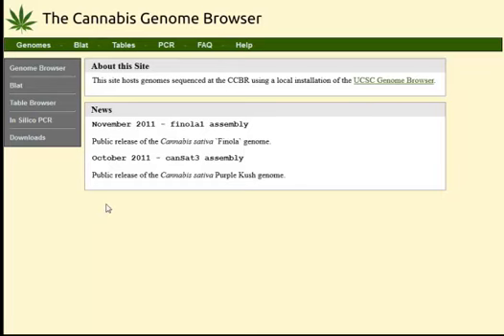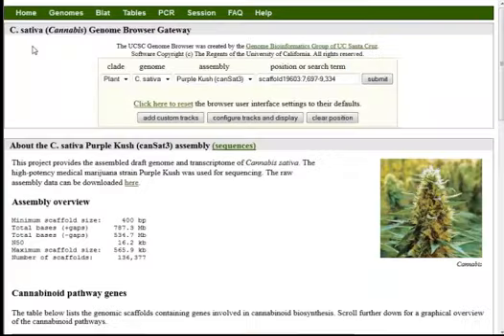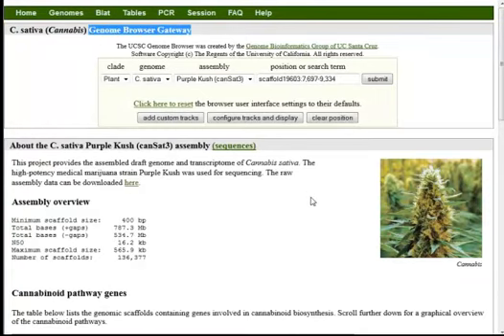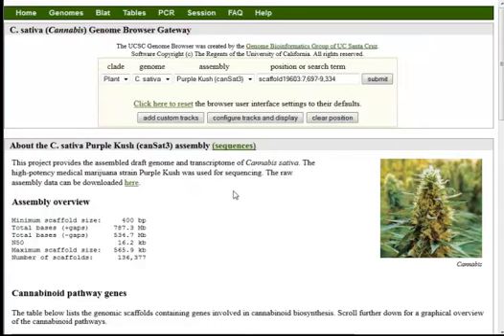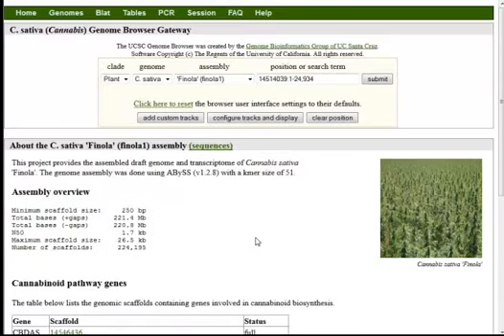Today I only have time to show you a couple of things. I'll quickly show you how to browse the genome. If you're here on the Cannabis Genome Browser and you click the link that says Genomes, you'll be presented with the Genome Browser Gateway where you can begin to search for things you might be interested in. When you first arrive, the Purple Kush Medicinal Genome Assembly is the one available, but if you're interested in the hemp, you can simply switch the assemblies. For my purposes today, I'll continue to use Purple Kush.